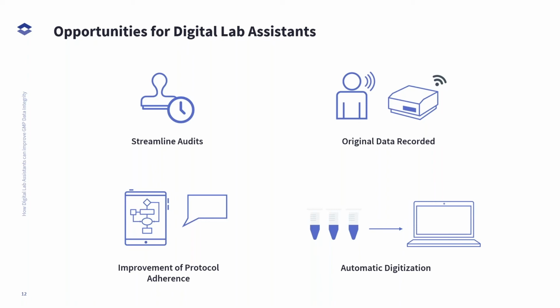The FDA actually came in and inspected our organization. They did accept this practice. They also understood the constraints in place. So I really feel that the utilization of digital lab assistants, voice activated technology, would be something ideal for some areas of GMP production.